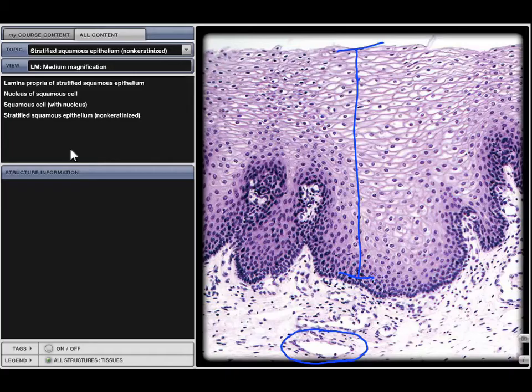You'll learn more about how to use the ocular micrometer for cell measurements in the lab this week. And if you have any problems finding the cells that you want to measure, be sure to ask your instructor in the lab.